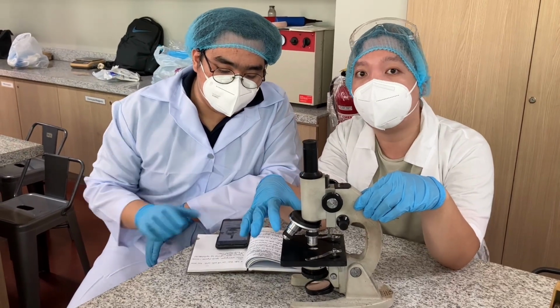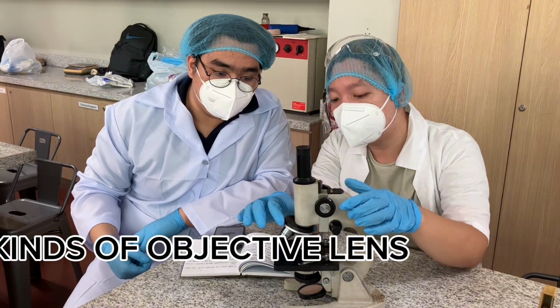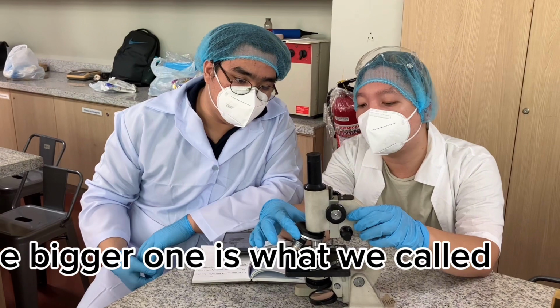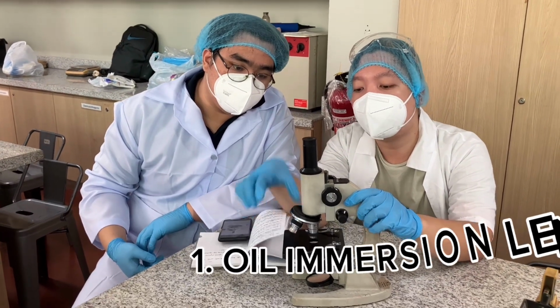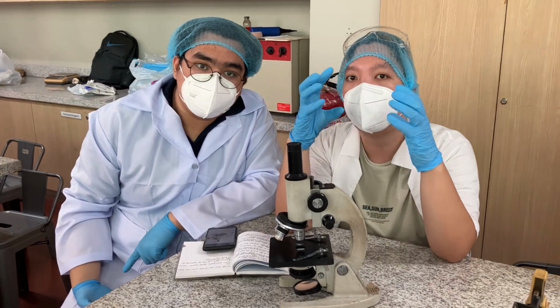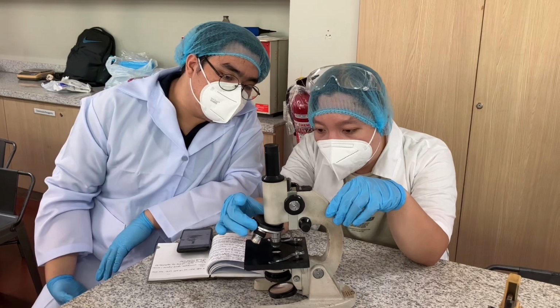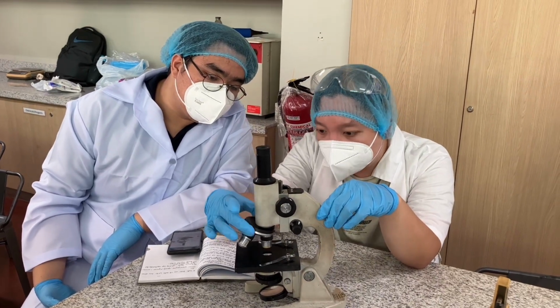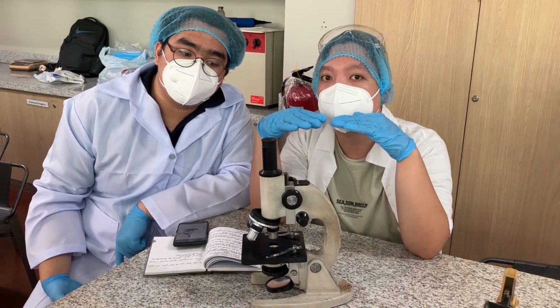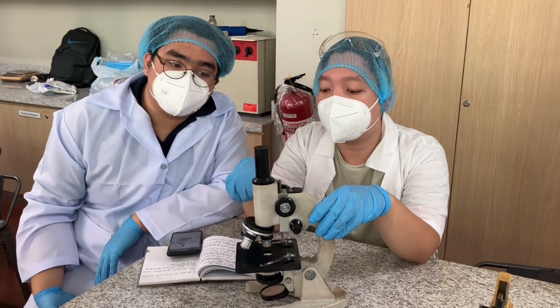And in our objective lenses, we have three kinds of objective lens. So first thing, as you can see, this bigger one is what we call the oil immersion lens. Its function is to eliminate air and make sure of a high-powered view, also to focus on our specimen. Next is our scanner. This is for the macro level, to make sure that we can also see all the basic surface and catch up also the specimen itself.